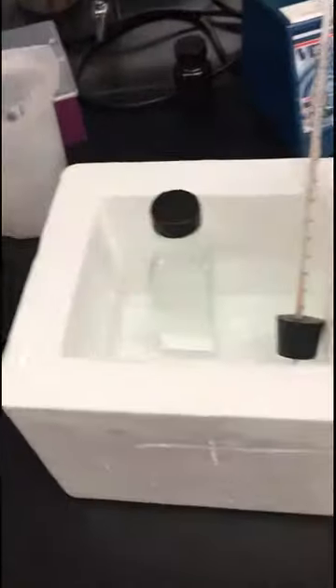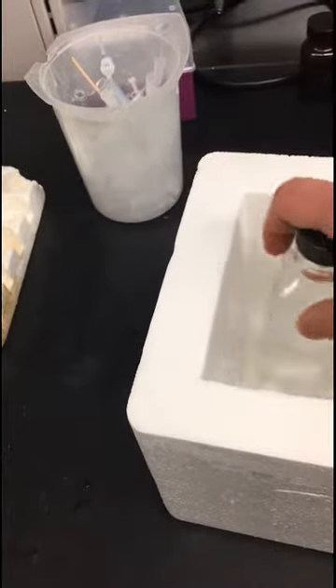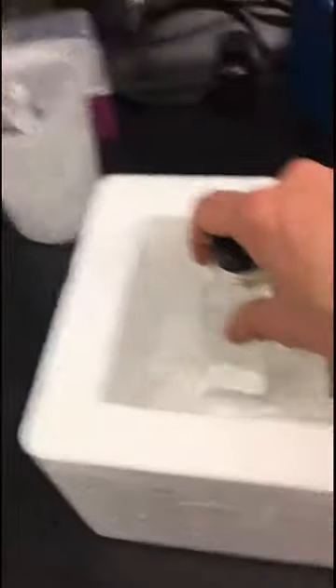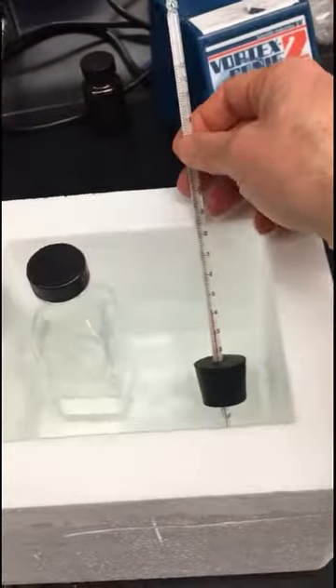Eventually we did get the agar melted — I'm sorry that wasn't captured in the video. Once it starts to boil and you see bubbling, immediately stop it, shake it up a little bit, make sure the cap isn't on tight, and then move it into the water bath. The temperature you want to shoot for is about 45°C. My water is a little bit cooler but my agar is pretty hot, so I'm just going to stir it until it comes to temperature, monitoring the temperature.